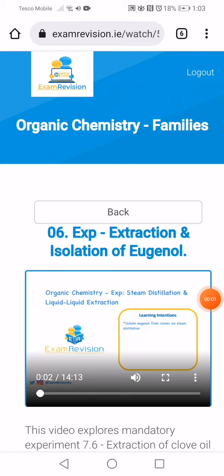Going to have two parts to it. The first part, we're going to look at the experiment on extracting clove oil from cloves using a process called steam distillation. And then the second part, we're going to look at isolation of eugenol from an emulsion of clove oil and water by a process called liquid-liquid extraction. So our learning intention is to isolate eugenol from cloves via steam distillation.